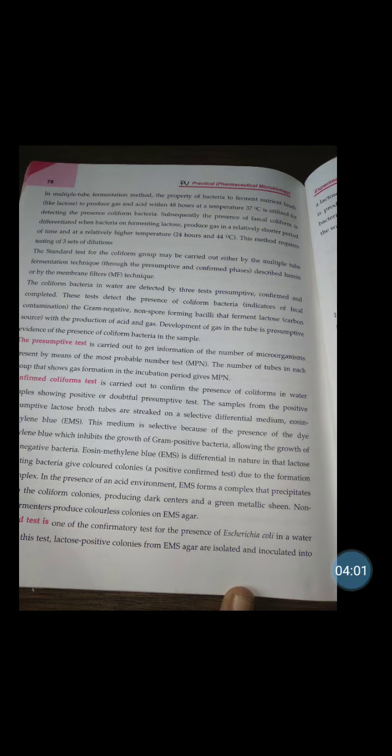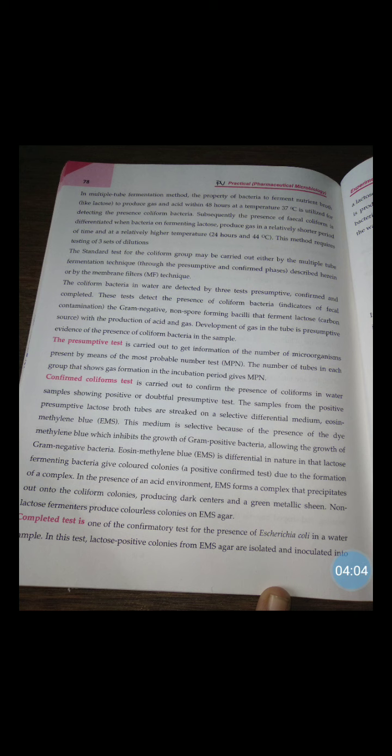In the multiple tube fermentation method, the property of bacteria to ferment a nutrient broth like lactose to produce gas and acid within 48 hours at 37 degrees Celsius is utilized for detecting the presence of coliform bacteria.